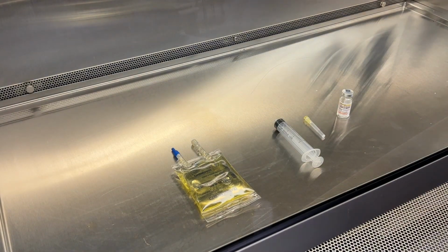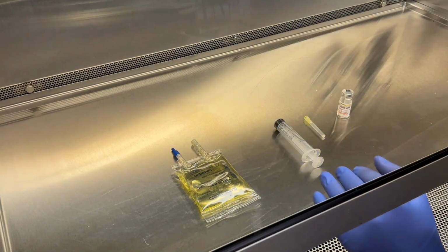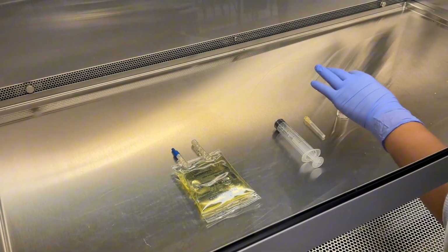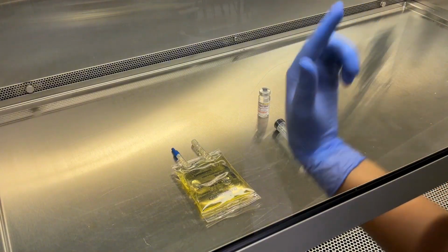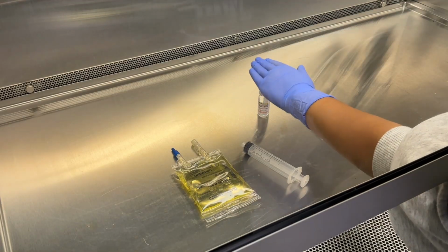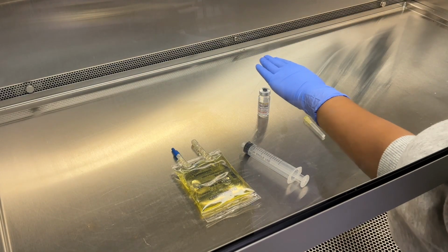So now I move to the vertical flow hood. The position of your critical sites are going to be a lot different from if they were in the horizontal flow hood. Your airflow is coming from the top, so you want to make sure that your airflow is directly hitting the critical sites without anything blocking it. So this is perfectly fine, but if you were to have something blocking it from the back, that would be okay because your air is coming from the top. What wouldn't be okay is if I had, let's say, my hands covering the top of the vial. Then that wouldn't be okay because the airflow isn't directly hitting the top of the vial, it's hitting my hand.